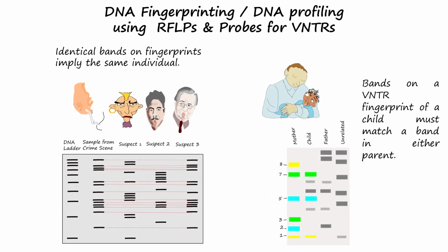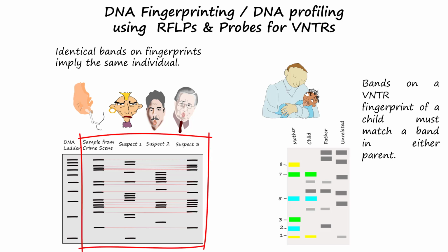Interpreting results involves pattern matching of bands on the VNTR fingerprint to reference VNTR fingerprints. The pattern of bands is unique to individuals, as individuals have different restriction enzyme cutting sites as well as different combinations of the many mini-satellite alleles at the multiple mini-satellite loci.